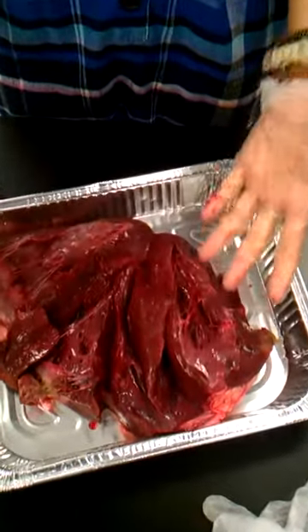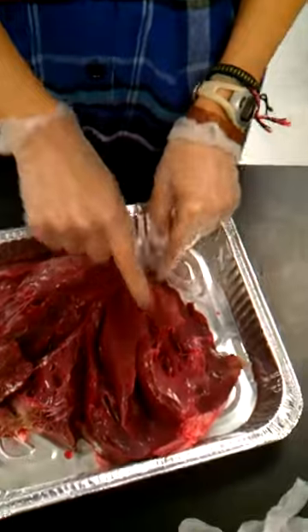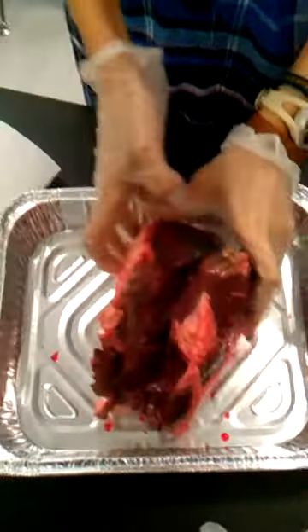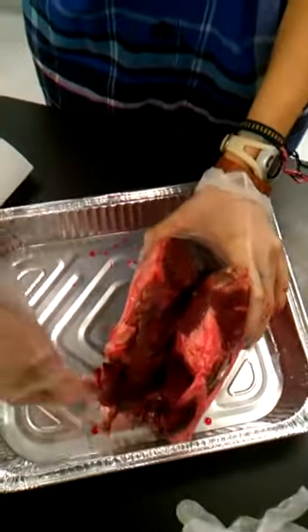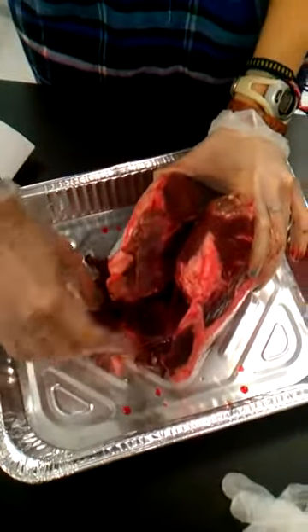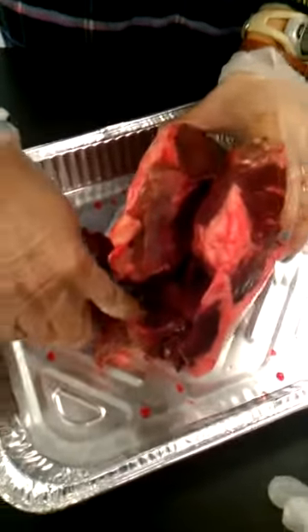Now I'm not an expert on cow hearts, so I'm not entirely sure what the name of this blood vessel is, but you can see that the blood would come in through vessels that you see here. See how there's blood vessels here? They look like little tubes.